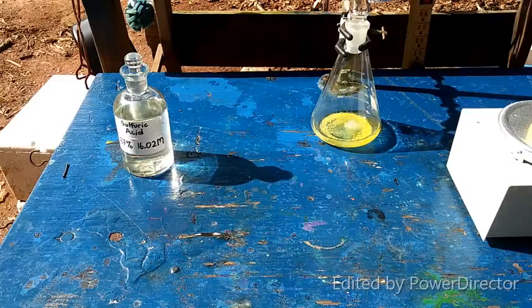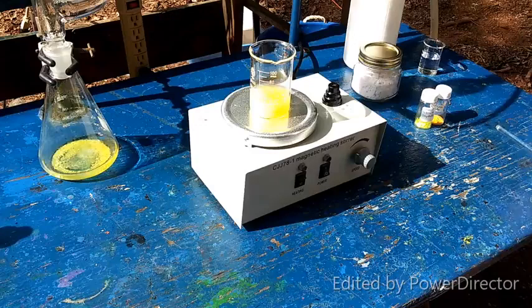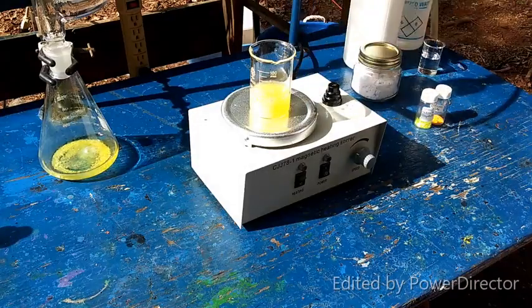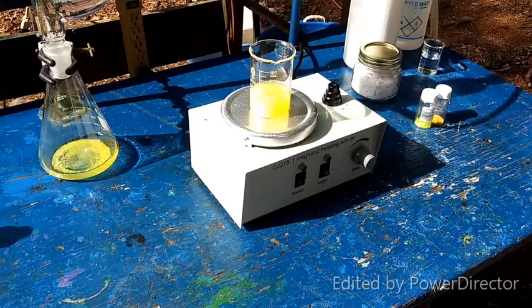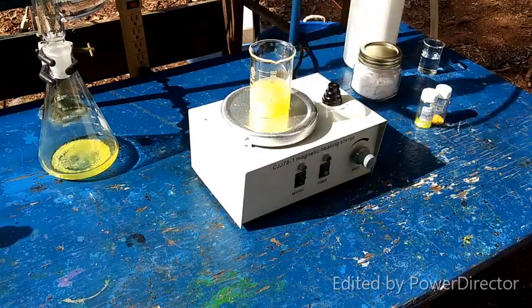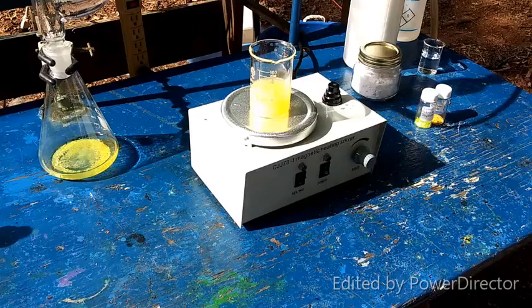Okay, now, this is stirring. Last time I let this stir for a little while until it had clarified some. So I'm probably going to do that again just to make sure everything works out okay. Yeah, I may not have had enough water in there before. There we go.